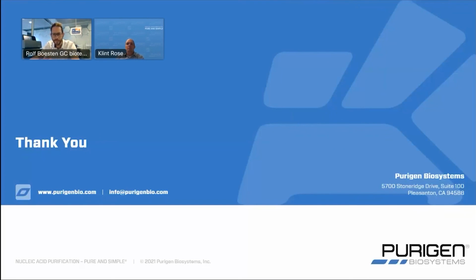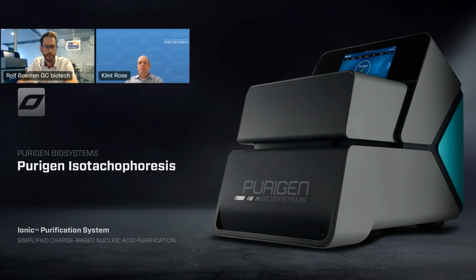No, thank you. Another question, is the procedure applicable for other types of samples, for example, blood, etc.? So that is a type of sample that is in the development pipeline. We don't have a kit right now for working with blood samples, but it is a type of sample that we're very interested in. So expect to have something like that in the future, but not for the kits that we're selling right now.